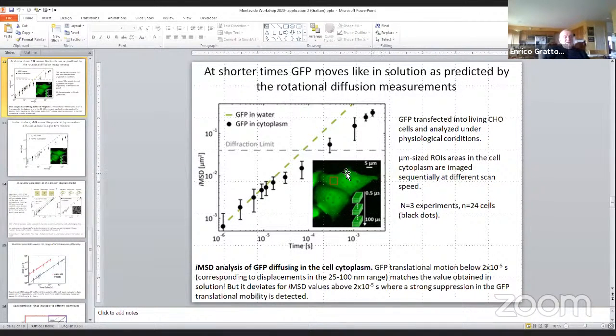If you have to go far, if you get the ER or the other things, it's changing. But you are measuring by the intersection of those two points. This is water, and this is interception. So that point of intercept is when the two things start to go together, and that happens in different positions. You are absolutely right. But that's great, because you can say, okay, within these places you are more confined or less confined. That's great, and with a determined pore size, let's say. You get the average size, of course. Exactly. The size is the average.